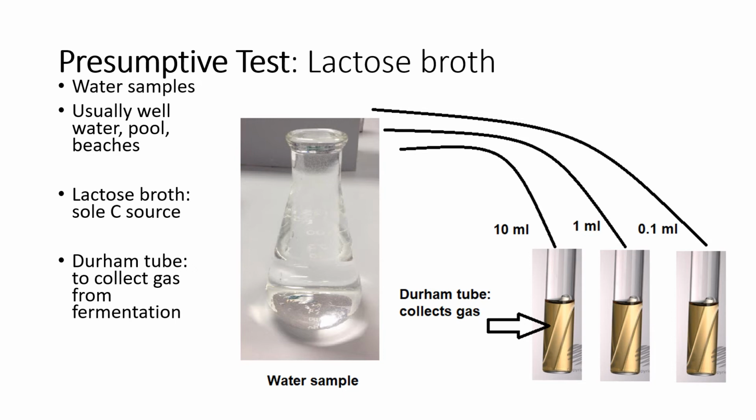And so typically people would bring in well water from their house, and from the tap in the house, and well water from the well itself. And that's kind of a good test because then you could see if the filtration is working. You can also bring in pool water, like a public pool. You can also bring water in from a beach or a pond or a river or a creek or whatever. Those were the samples that I would ask you to bring in.